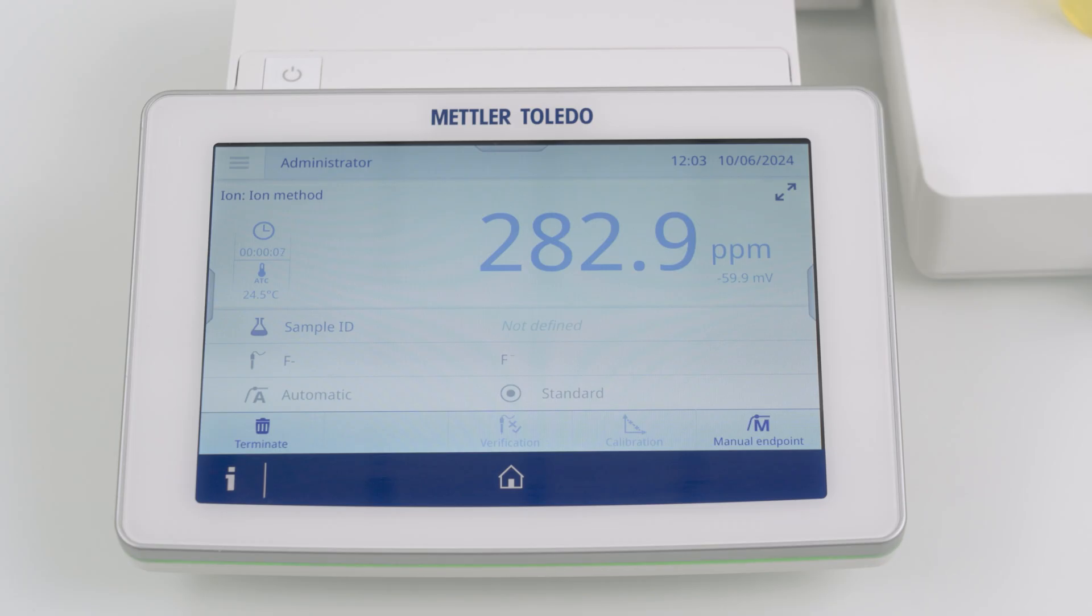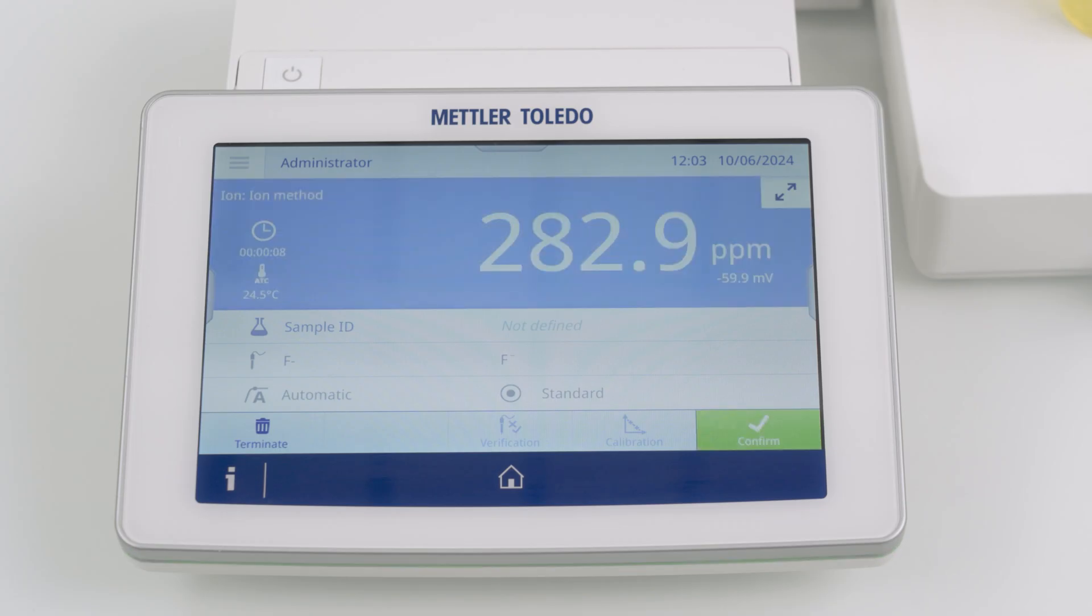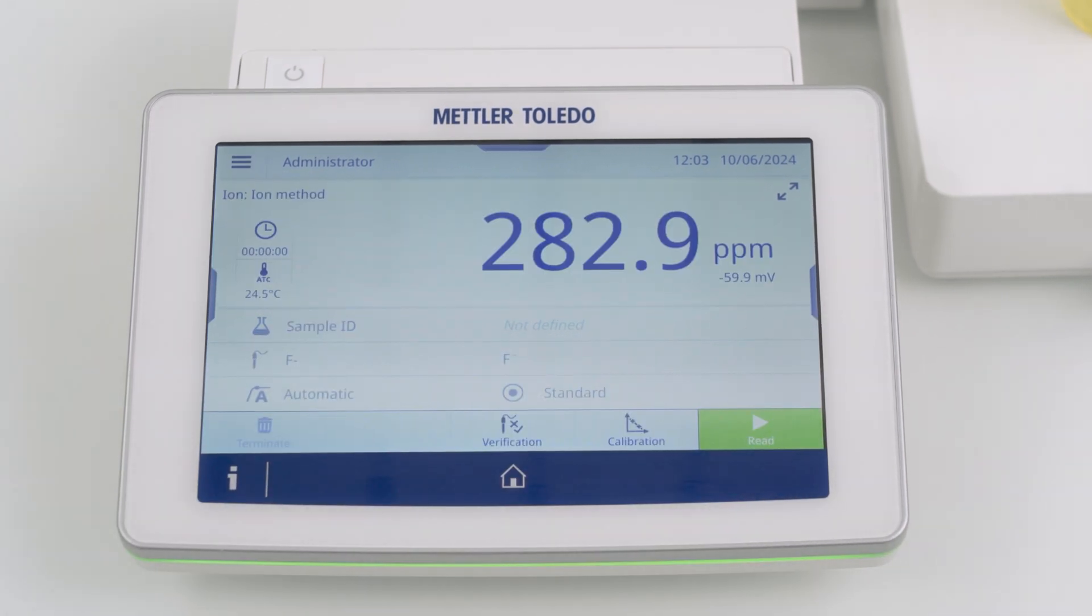The measurement reading appears on the screen. Once the reading gets stabilized, press confirm and record the reading.